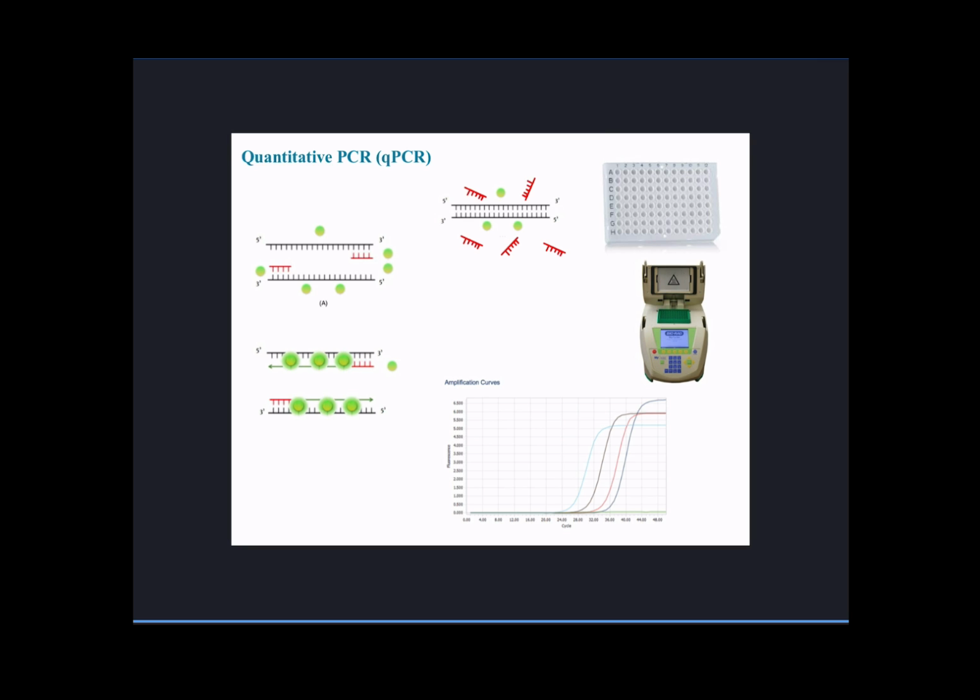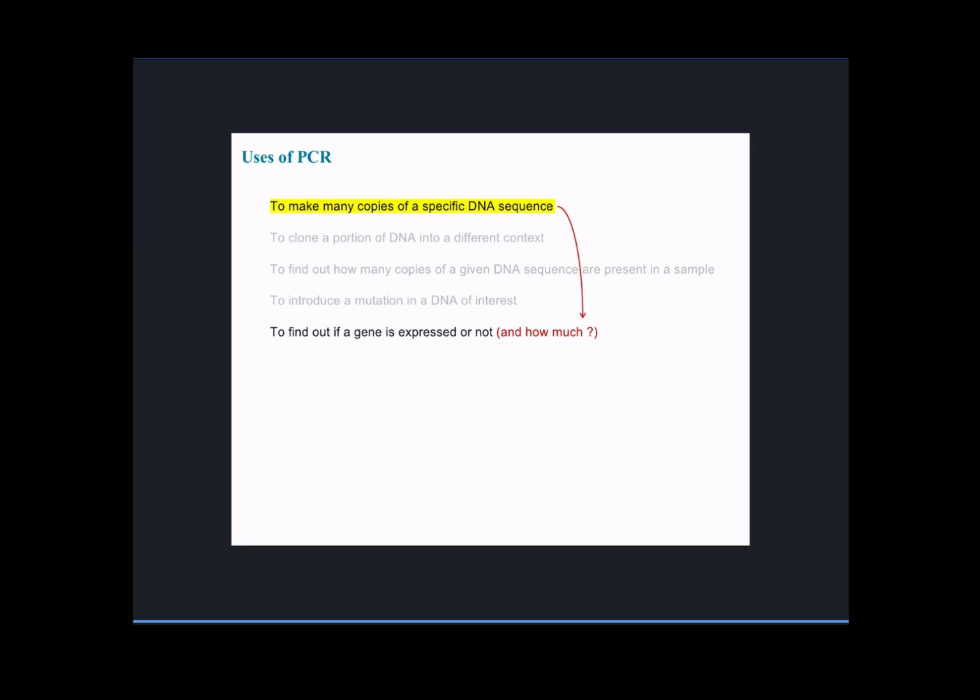And that's where the linearity of that formula that we were thinking about before comes into play. The more template molecules that were present in a sample, the faster that linearity will be reached, the faster this machine will be able to see all of these pulses of light coming out of those wells. The fewer, if any, of those template DNA molecules present in a sample, the longer it will take for these things to start fluorescing enough that the machine can detect them. Let's move along.